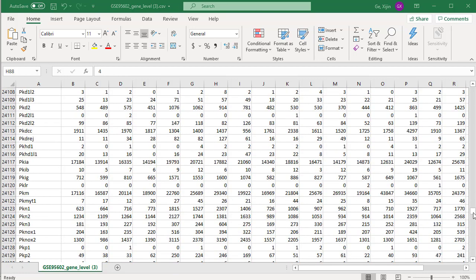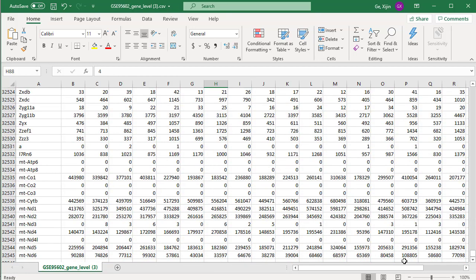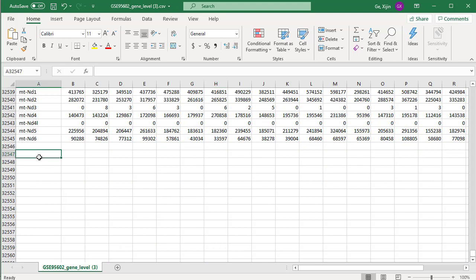Excel sometimes can recognize gene symbols as text and convert them into dates. For example, SEPT2 is a legitimate gene. But sometimes it's converted into a date; for example, here it is converted to September 2nd. So make sure we avoid that kind of thing. To avoid that in iDEP, what I did was insert a space in front of these gene IDs, as you can see. This will prevent auto conversion.